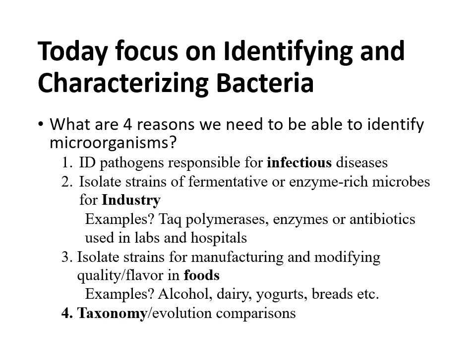The first one makes a lot of sense, especially nowadays, and that is primarily the medical aspect. So it's really important for us to be able to identify and characterize microbes because a lot of them are pathogenic and deal with infectious disease.